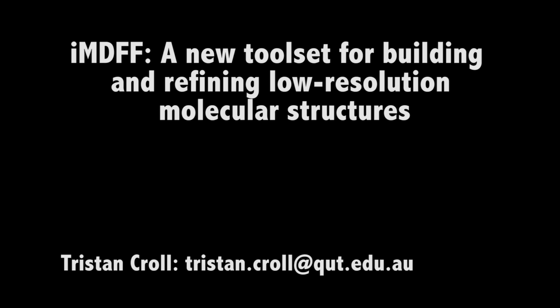When your experiments behave and give you a nice high-resolution crystal dataset, building and refining the matching model is a straightforward and mostly automated process these days. If things don't work out quite so well and your best crystals only diffract at 3 angstroms or worse, the process is still quite challenging.